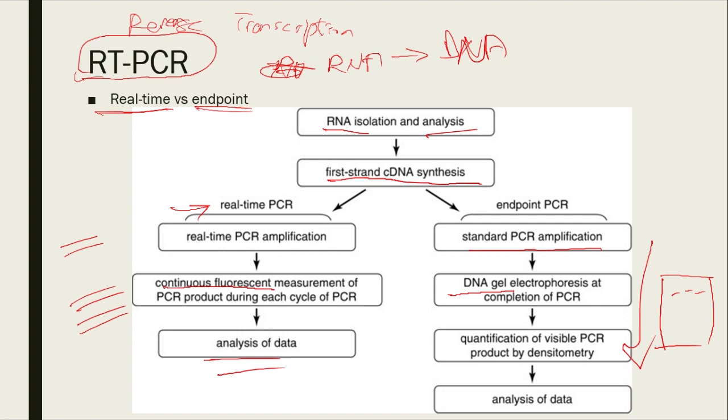Many times in my lab, students are not sure if certain DNA pieces are amplified or not, because it comes with experience. Sometimes I see a band, students don't see a band, but after they've been in a lab for a while, they start developing very keen eyesight, the eyesight of an eagle, that can spot a very faint band on a particular gel that they weren't able to when they first started. So it is very user dependent. But that's what I mean. It takes time to get to that skill.